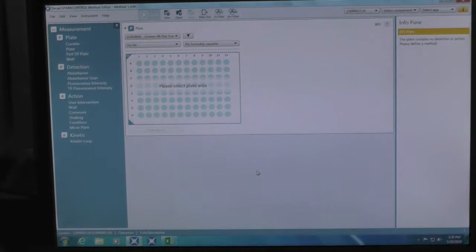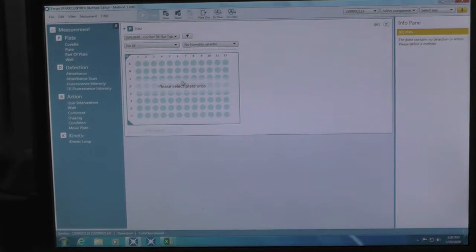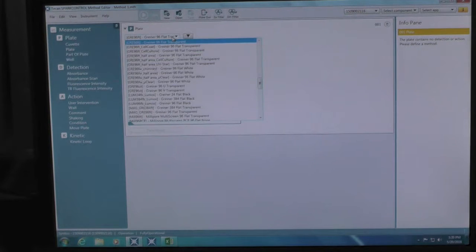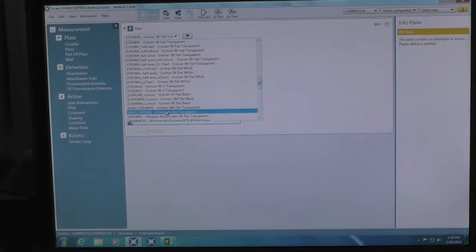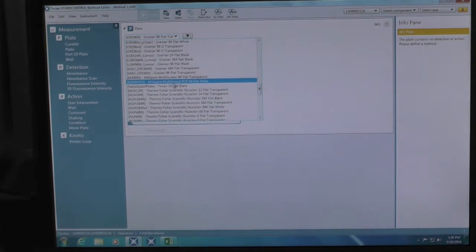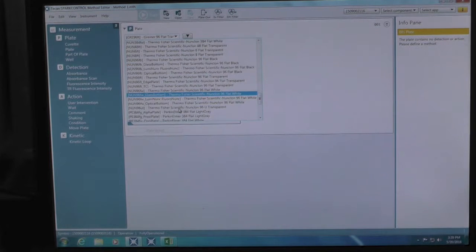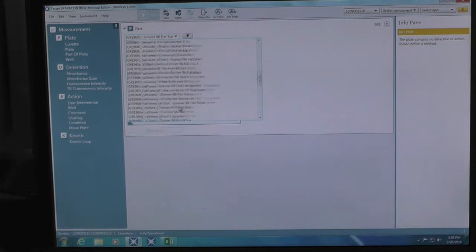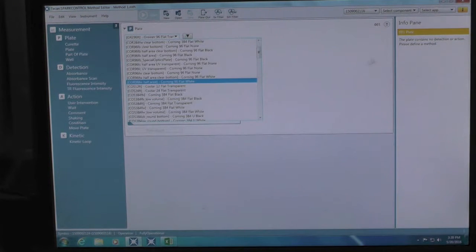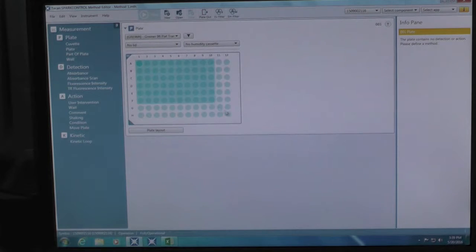Choose the specific type of plate you will be using for the assay. For example, manufacturer, number of wells, shape of wells, black, white, or transparent plates, etc.